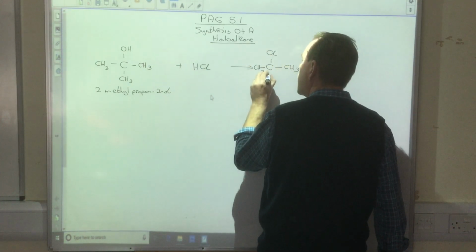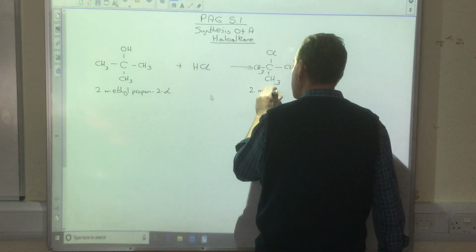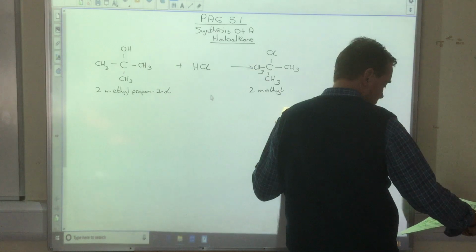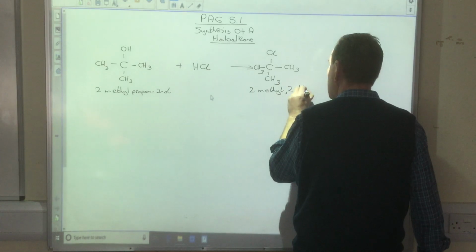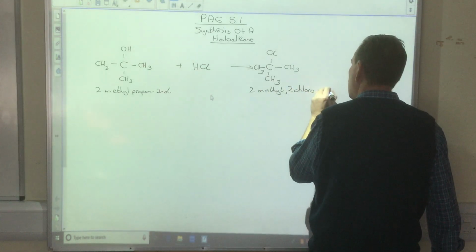So we're going to make 2-chloro, sorry, I've got it the wrong way around, 2-methyl-2-chloropropane.